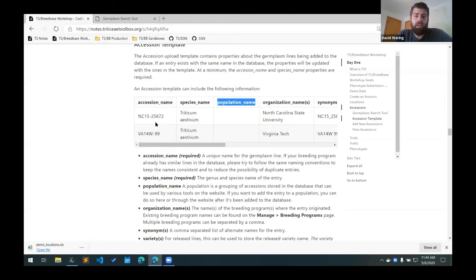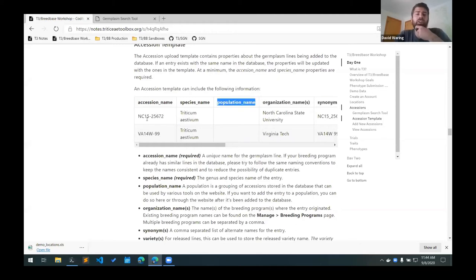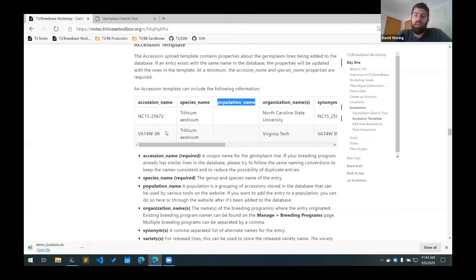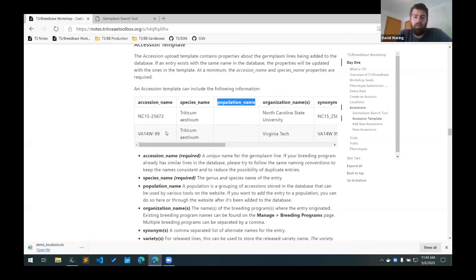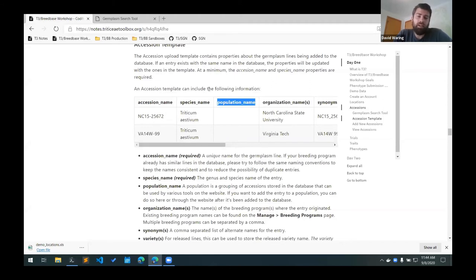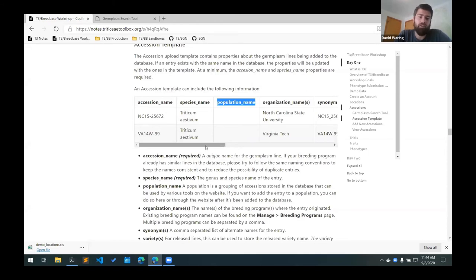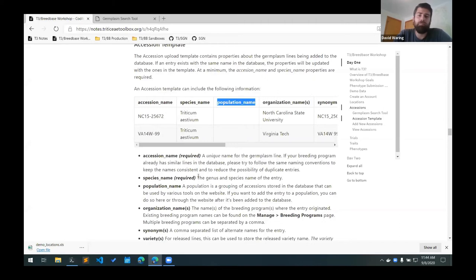The population name column is used if you want to add your germplasm lines to a population. And the population in Breed Base is used by some of their analytical tools on the website. You can also do this at a later point, so you don't have to do it right away. But if you add it to the accession template, it will add that line directly to that population. It's just a way of grouping accessions and it's used by some of the tools on the website.